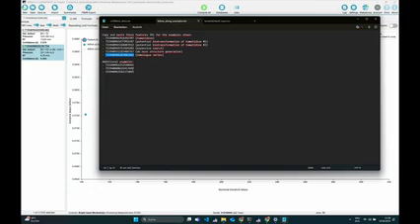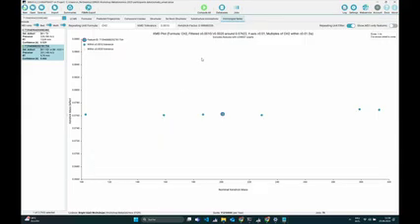So I don't want to show these additional examples, because maybe we can leave some time in the end for some questions. One thing that I want to show, and that Markus already talked about a little bit, is that there is now an API which is quite powerful, and especially because the title of this workshop is also automated analysis, and now we looked at SIRIUS and looked at all the different panels, but sometimes you just want to get a brief overview on whatever you have in your data, and beyond just going for high confidence hits, you can also use the API for this to make some data analysis.